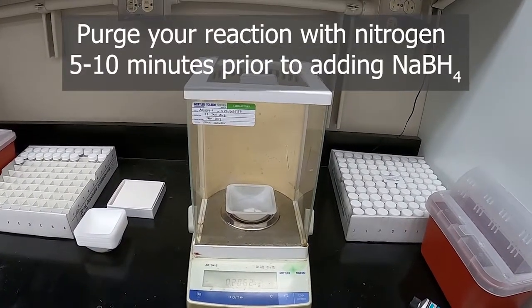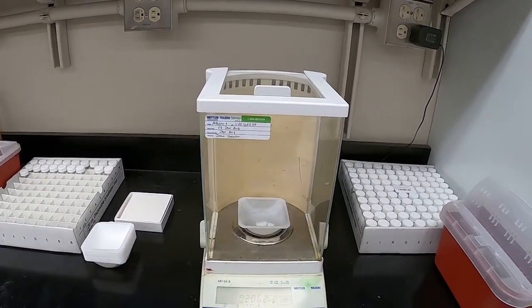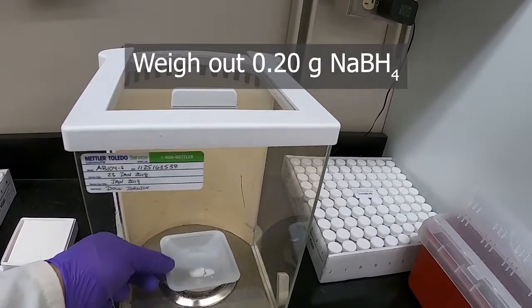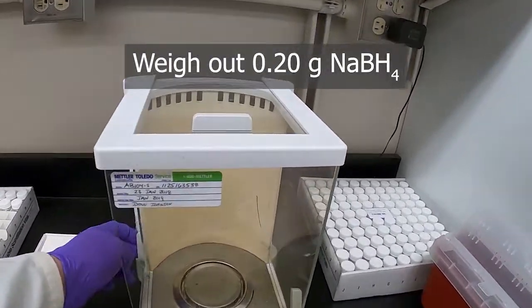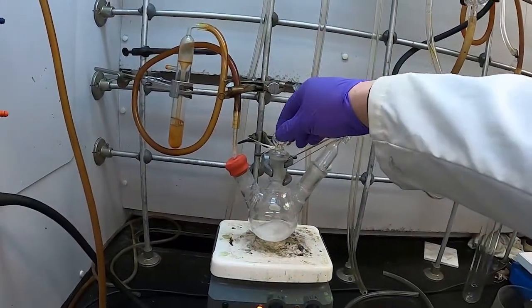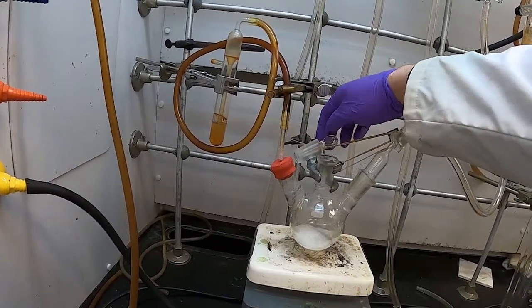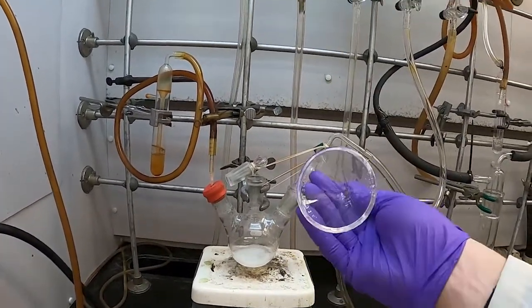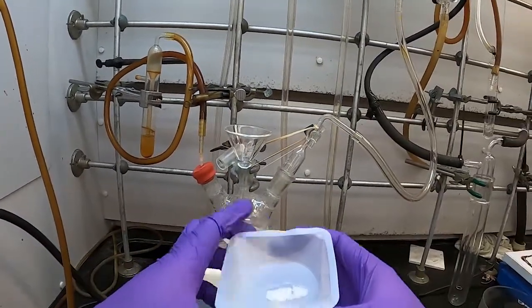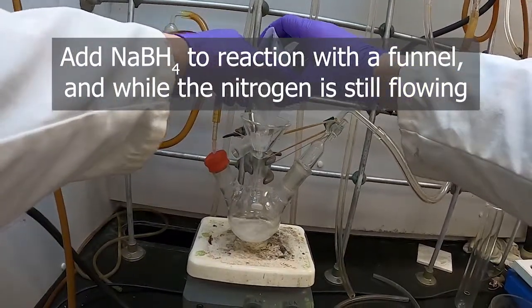While we're purging that flask with nitrogen, I weighed out the sodium borohydride that we need for the next step. So I've got the 0.2 grams here. Take that off the balance. We can take it over here and we will remove the stopper here from the top. Just set it there, convenient. I've got a dry funnel here just so that we can get it past the grease joint so we don't have powder sticking in the grease. And we'll add in our sodium borohydride.